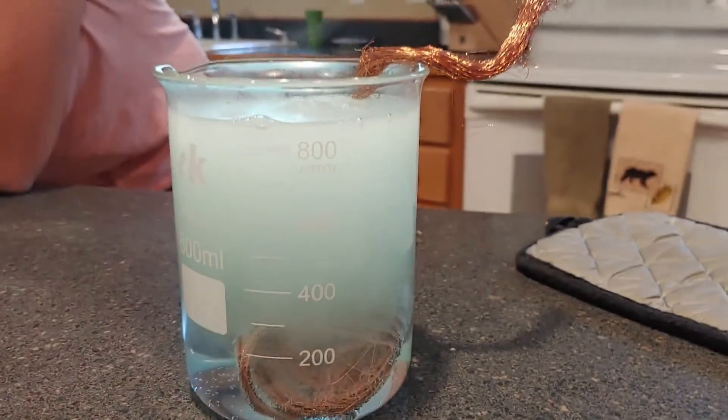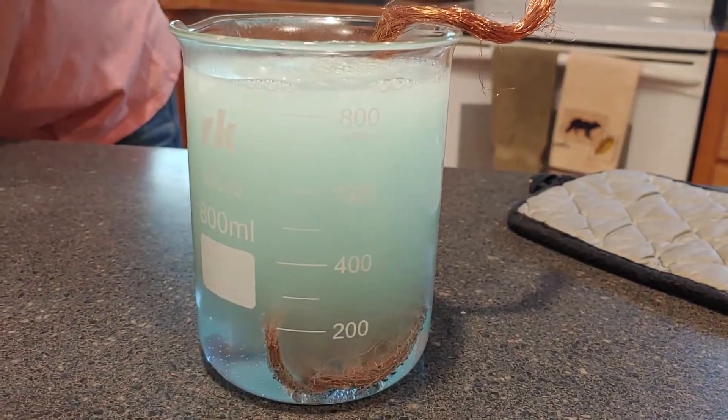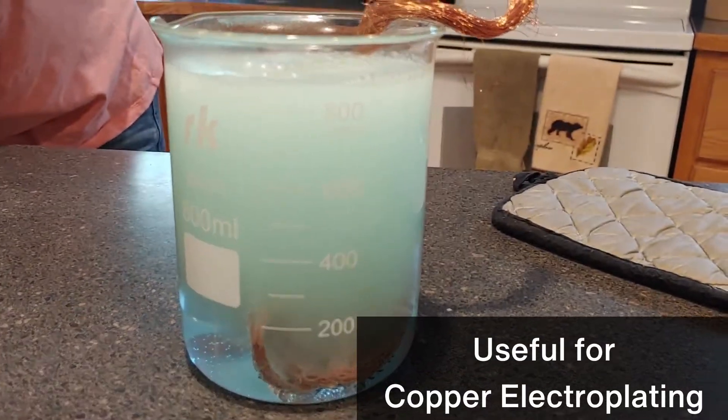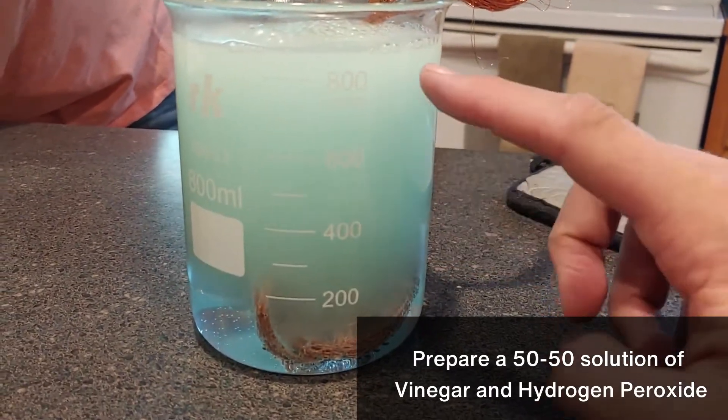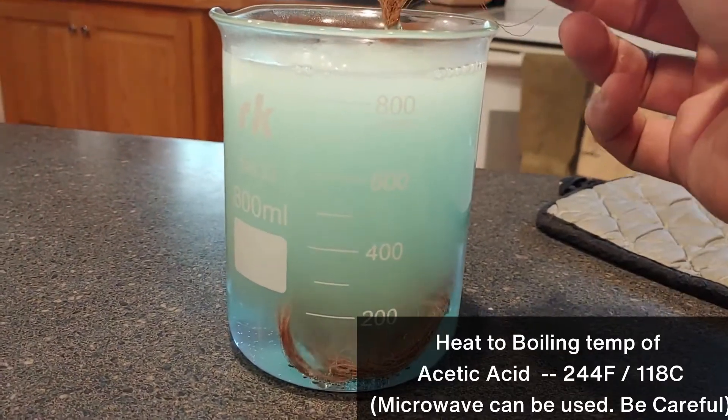We're making copper acetate today, and copper acetate is used in making copper plated things. We have our flask, which we filled halfway with vinegar and halfway with hydrogen peroxide, heated that up, and now we've added a piece of copper.